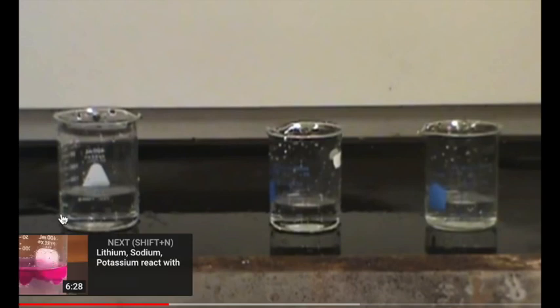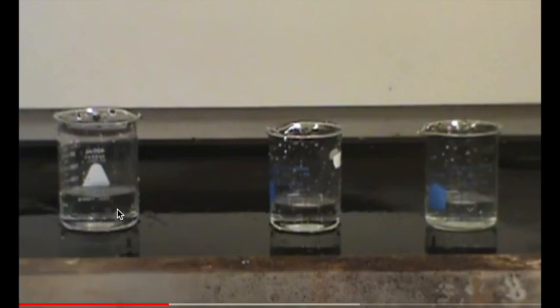So the first thing to notice is that there's a beaker here, and the beaker has water in it, and in each one of these beakers we've added what we call an acid-base indicator, which is a substance that will turn a different color when you have an acid versus a base.